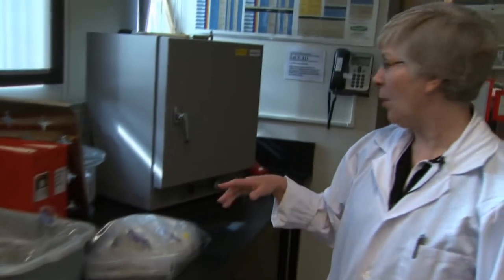Clamps, pipette stands, balances to weigh out chemicals, all kinds of things available to our students. Down here we make sure that we have the sharps containers for anything that gets broken.